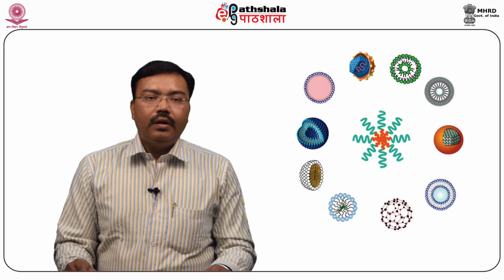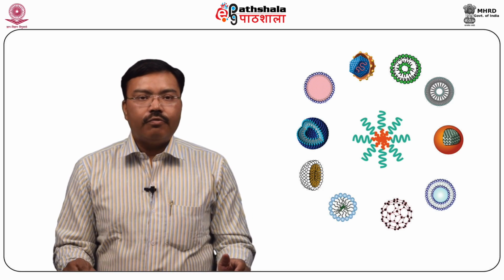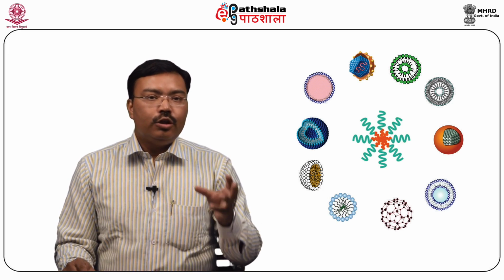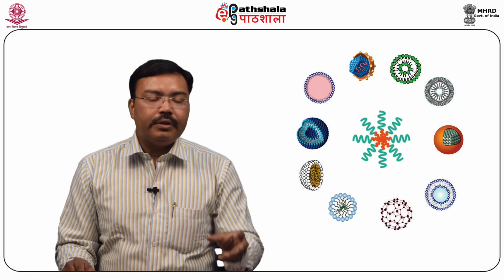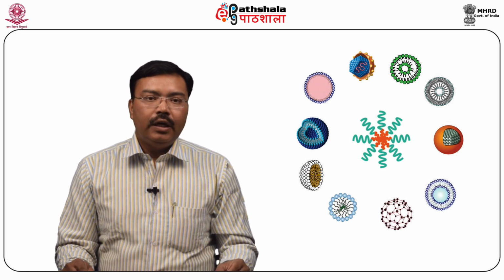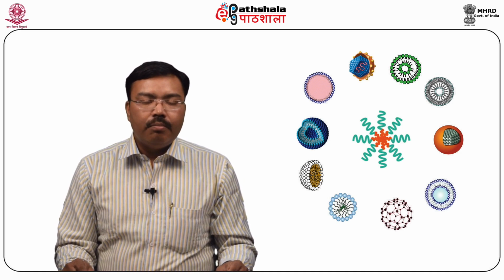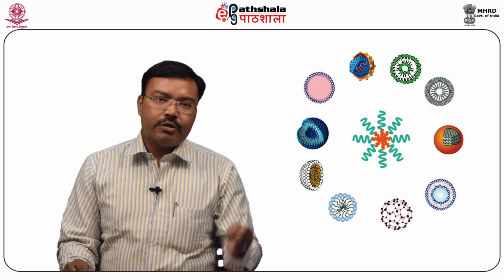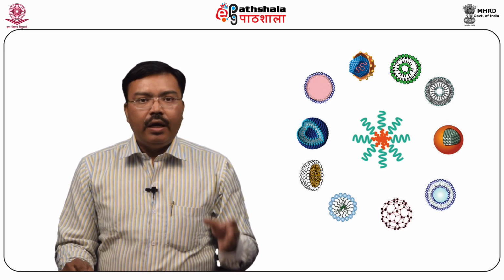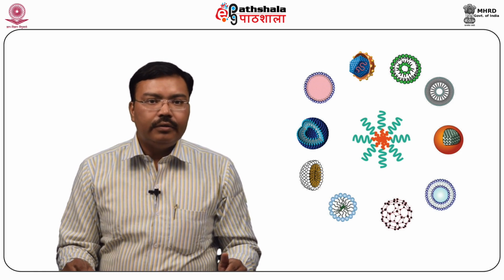Phase contrast microscopy is one of the techniques which provides illumination to samples that are transparent or translucent in nature. This technique was first developed in 1934 by a Dutch physicist named Frits Zernike. It is a contrast enhancing optical technique.